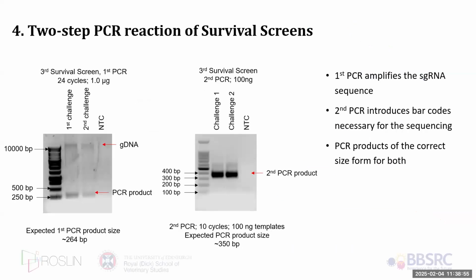And so these are examples of the first and second step PCRs. This, again, required a bit of optimization for us to get into the sort of routine of doing these. Kind of the key things are the amount of DNA that you include in the first PCR, because you want to use all the DNA you get, because that's all useful material and information. You want to cover any guide sequences in there. Anyone who does PCR on genomic template knows you don't want to put like 6 micrograms into one PCR because it's not going to like it and it's going to be very inefficient.